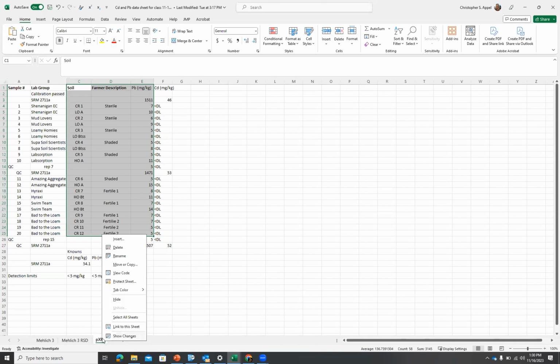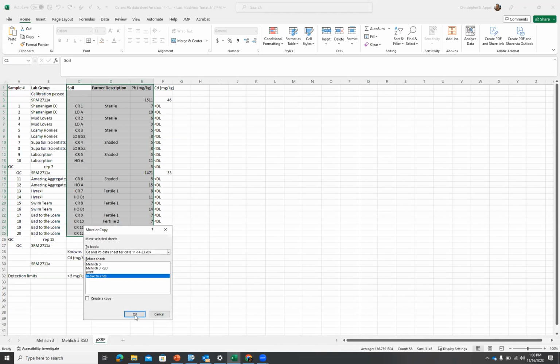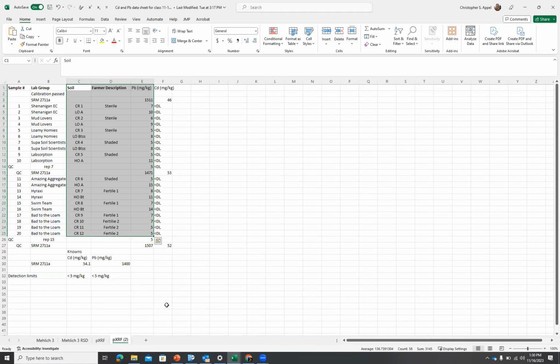So I'm just going to copy it like we've done before. And then all I'm going to do is get rid of the quality control stuff.